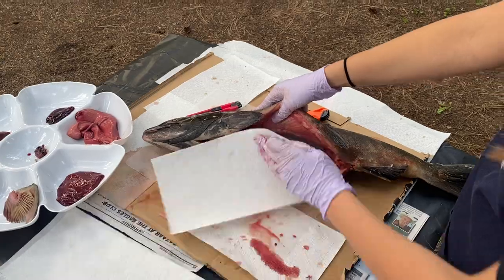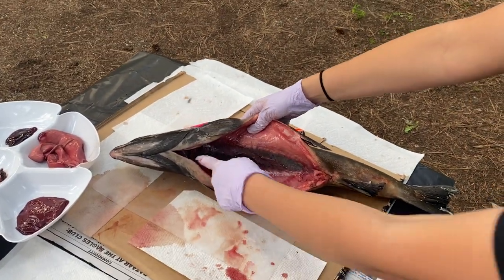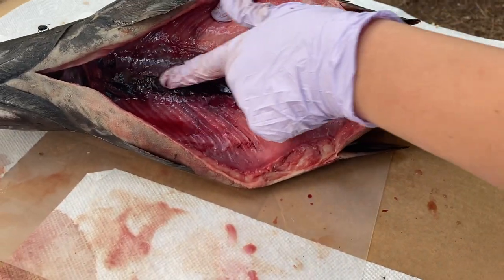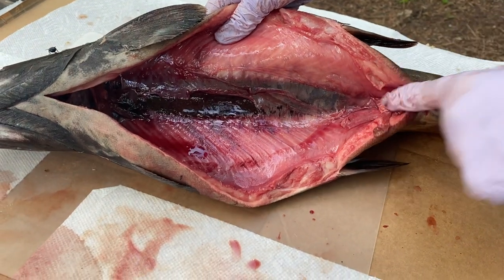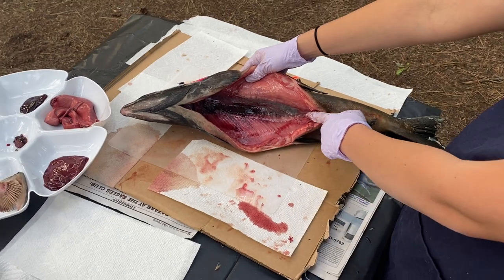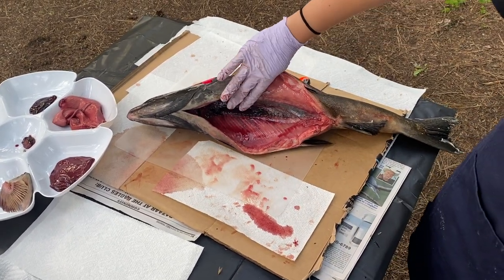The last organ we have is this dark red organ, and it runs throughout the whole backside of the salmon. And this is actually the salmon's kidney. So humans have kidneys. We have 2 kidneys. We could live with just one, but we have 2. And it does the same thing for the salmon as it does for humans. It has a lot of purposes. It removes waste from our blood. It's what produces our urine.